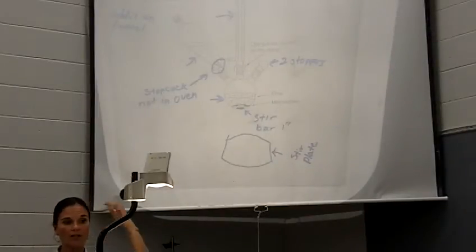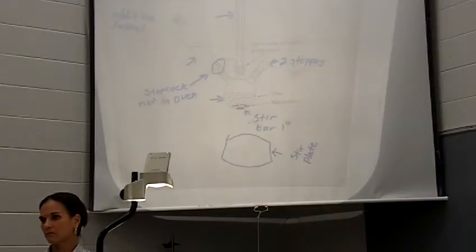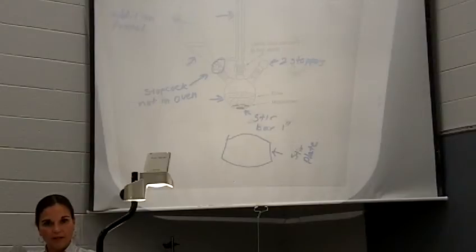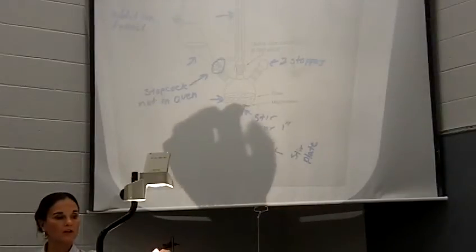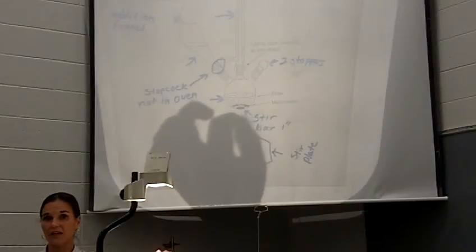Now what you want to watch for with this is changes in the reaction. So magnesium is a silver metal. Iodine, what does iodine look like? Orangish red color, right? So when you put iodine in there, you're going to see an orange-red color. You should start seeing bubbling on your magnesium from holding your hands under your reaction. You should start to see some cloudiness. You should start to see some of that color of the iodine fading. That means your reaction started.